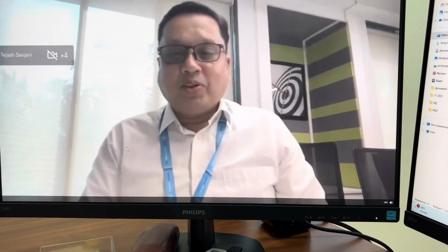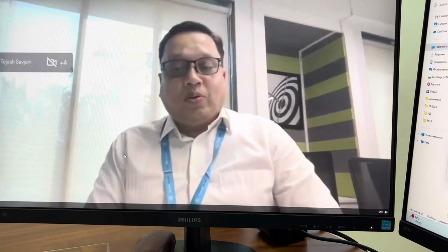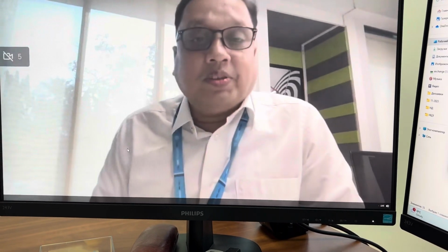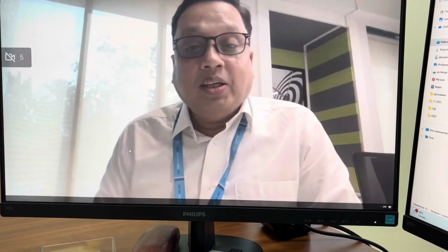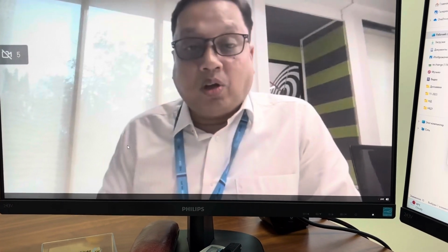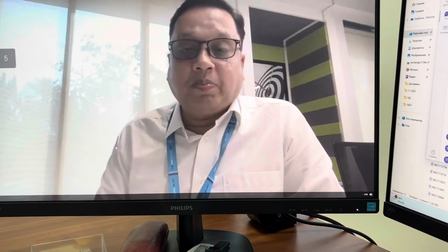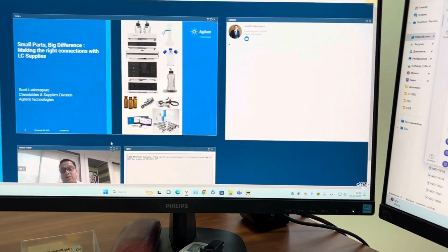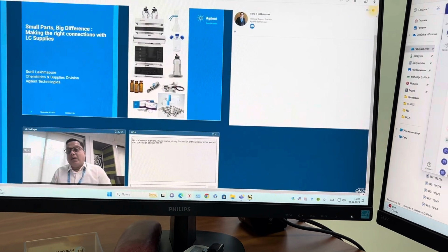Thank you, Tejas. Thank you for introducing me. Good afternoon, everyone. Thank you very much for joining this important webinar on supplies. We are having a power pack 3-part series for all of you, where we will be talking on LC supplies, GC supplies, and spectroscopy supplies. So starting today, the first session we will be discussing LC supplies.